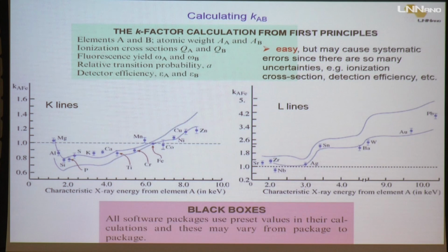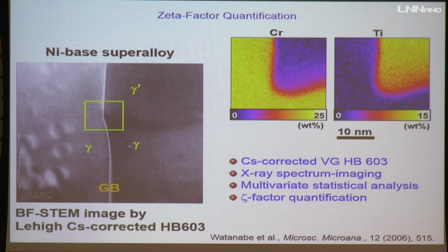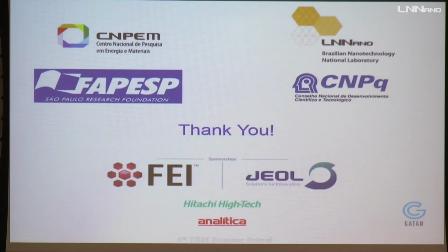I need to stop now because we are running into trouble with time, but I have almost finished. I just show some quantification. EDX is a mature and well-established technique. It's very good, much easier than EELS. We will have a very good machine here. It's the technique to be used in the near future.